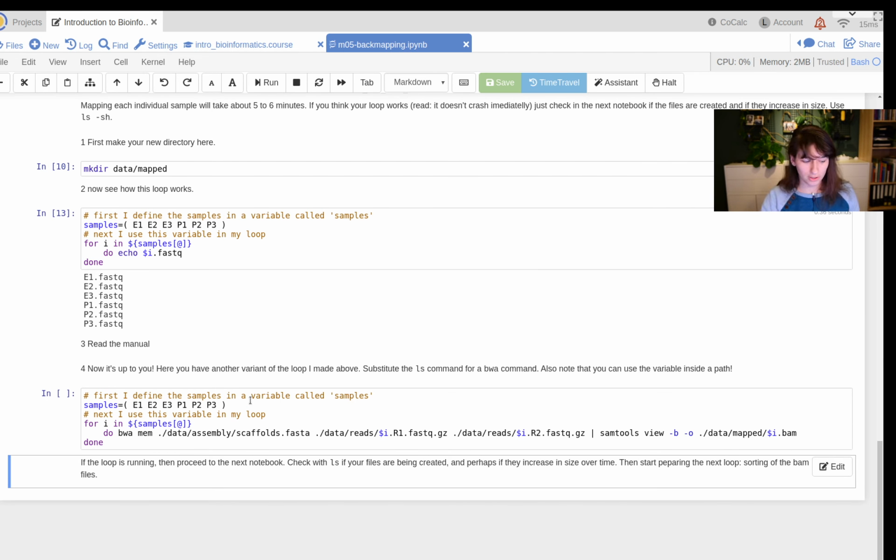Again, this will take quite a while to run. Let's hit Ctrl+Return and see what happens. Looking good. There's still this green dot on the side. If you are hungry and you fancy lunch or a coffee break, now will be a good time. This is going to take a bit. Yeah, so let's take a final second.